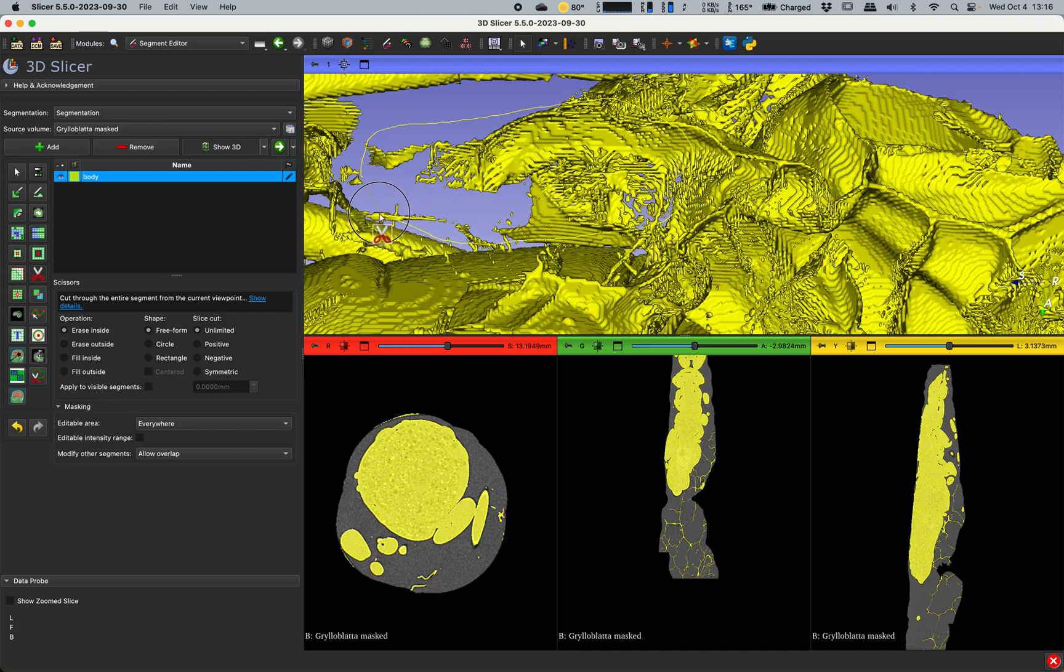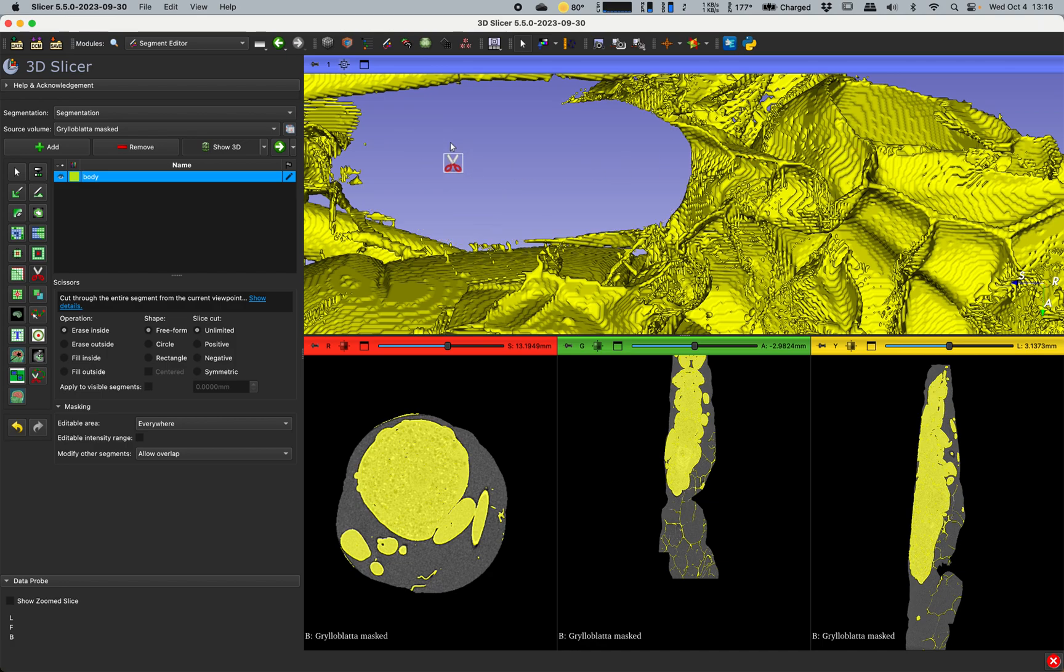If anybody has ever done fossil prep, this is very similar to that kind of operation. You're sort of removing things that you don't want. You have to be kind of careful to not remove things that you do want.